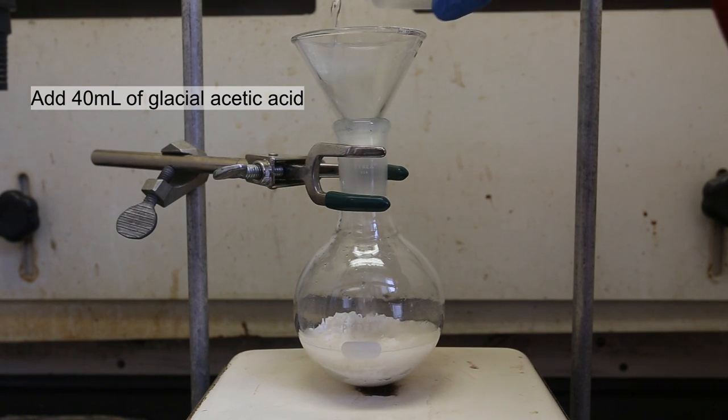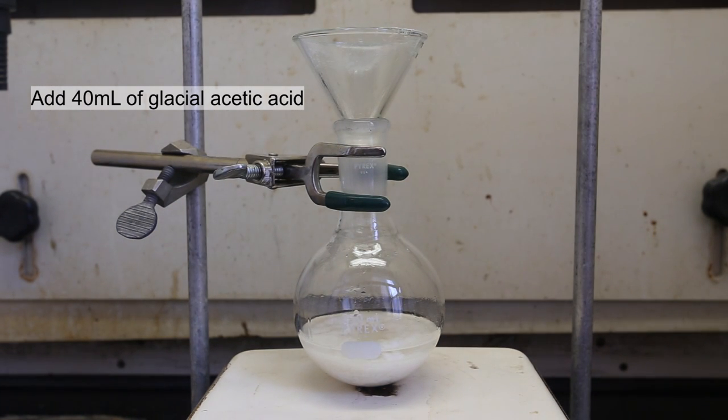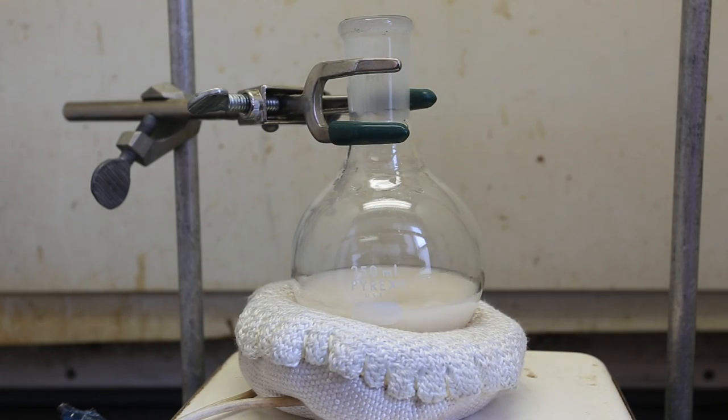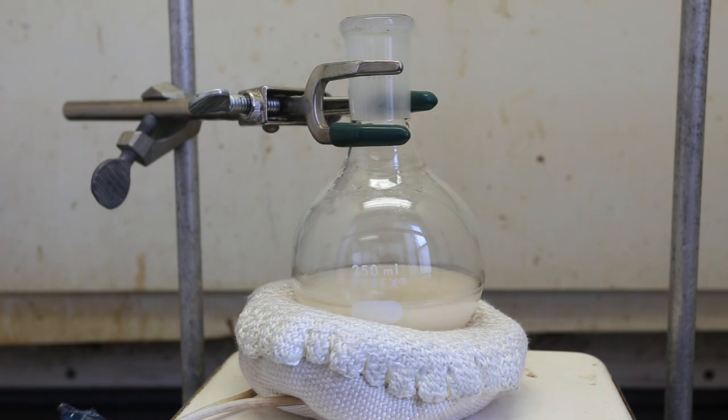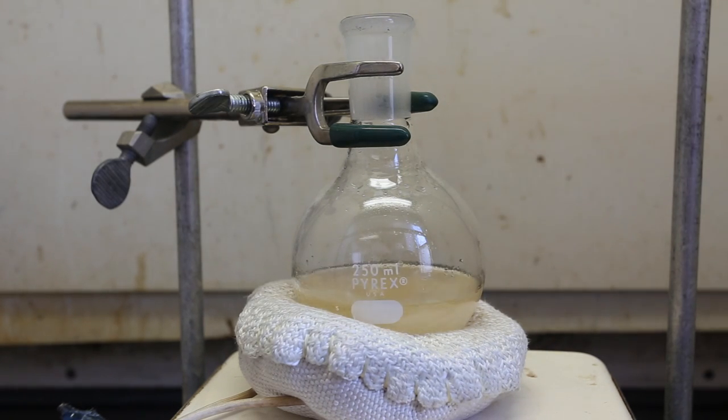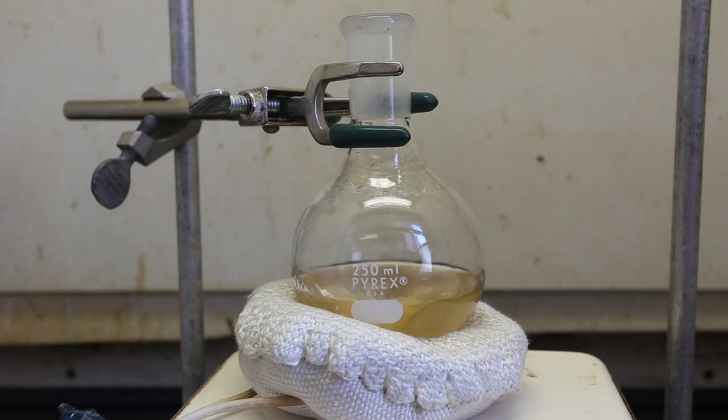There was still a significant amount of acetanilide remaining in the container that I added it from, so I simply measured out 40 milliliters and added it to the container to wash out any remaining acetanilide. The solution of anhydrous acetic acid and acetanilide was then heated with stirring until all of the acetanilide had dissolved. I had to heat the solution up to about 65 degrees Celsius for everything to dissolve. It is very important to not let the reaction get too hot, as the acetanilide could get hydrolyzed to aniline.